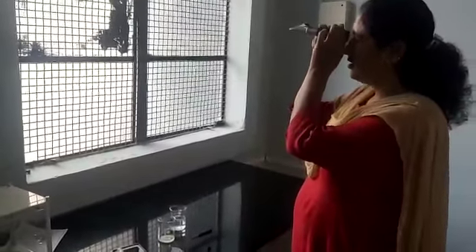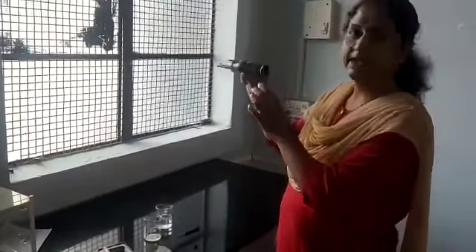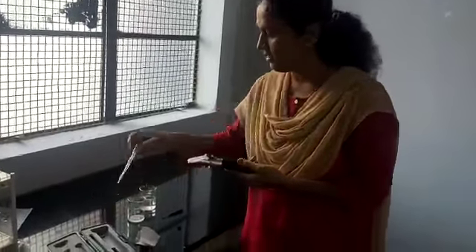Firstly, to use the hand refractometer, this instrument must be calibrated. First, calibrate this instrument with the help of distilled water.